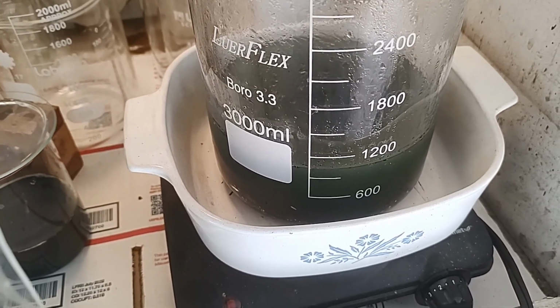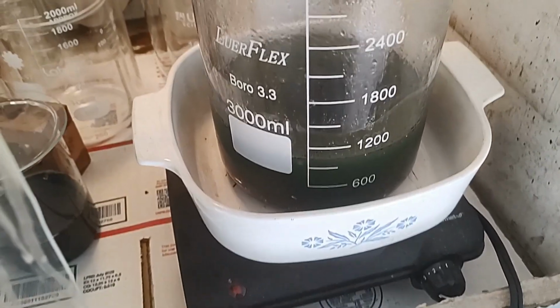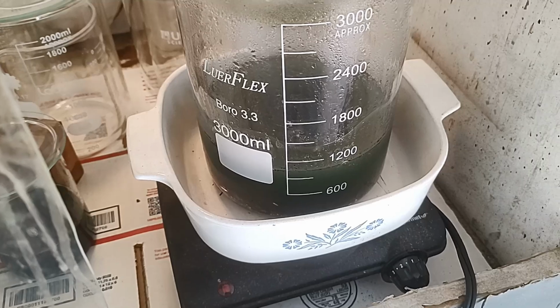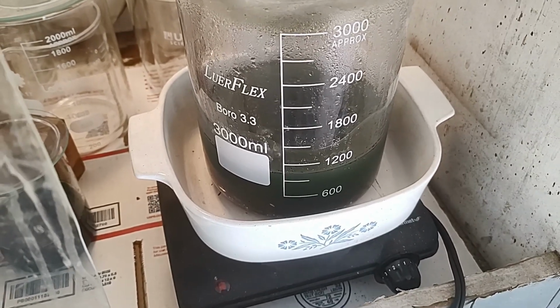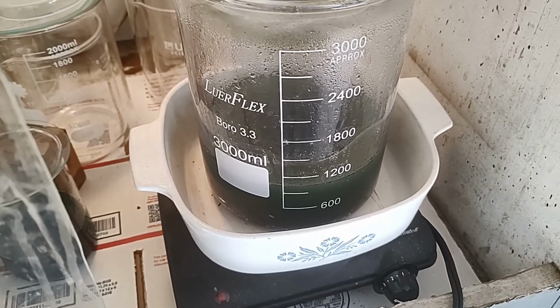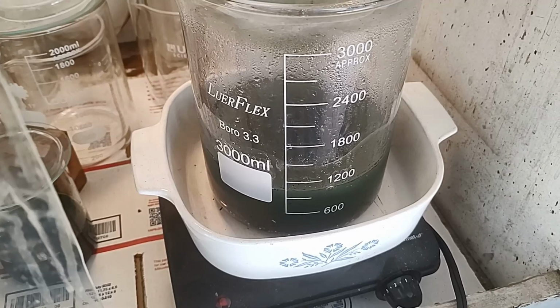Excellent. I'm going to keep this up until the reaction stops, and then probably decant off this liquid and give it another treatment, just to make sure we get as much of the iron, steel, zinc, anything else that might be in there, tin, off of these things before we move on to the next step.